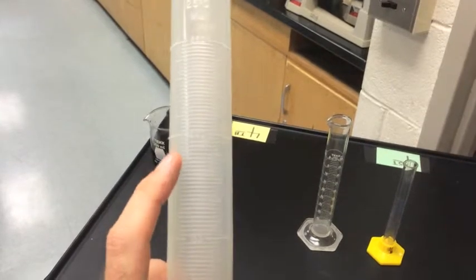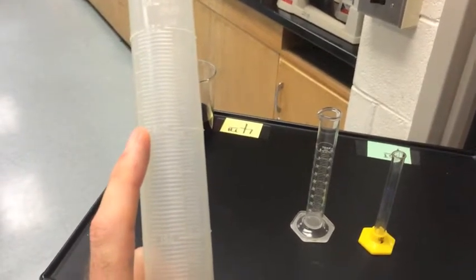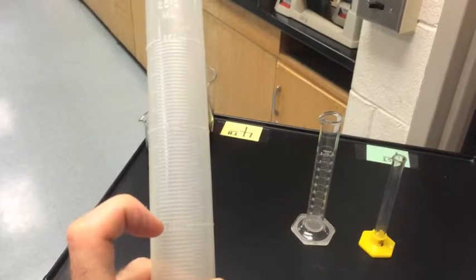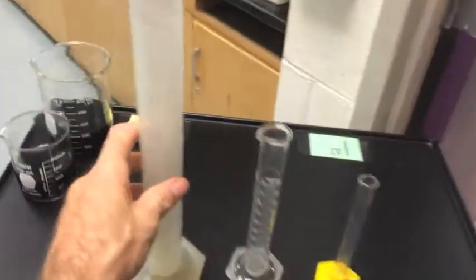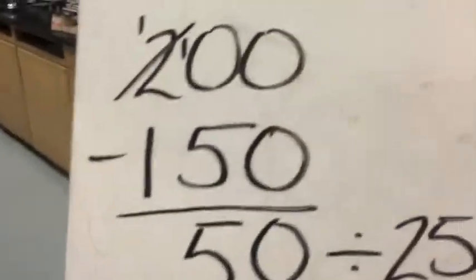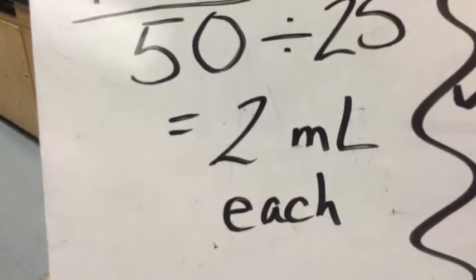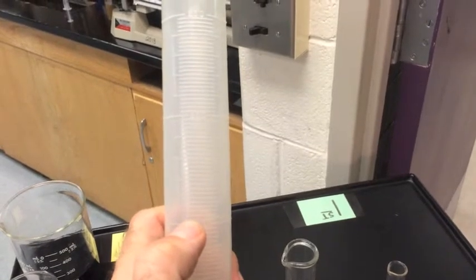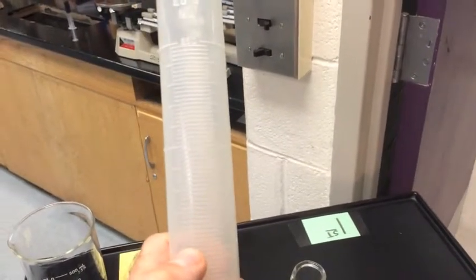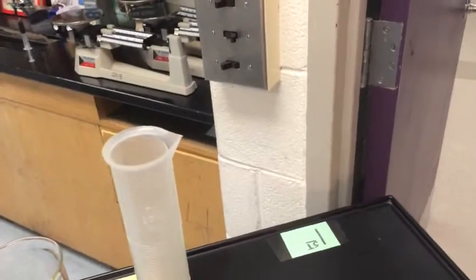Remember the formula that I'm teaching you about how to find out what each graduation, each line going up the side is worth. We take the top number, 200, subtract the next number down, 150, and then divide that number by how many graduations there are. It just so happens there are 25 of them, and so I did the math. 200 take away 150 is 50. Divide that by 25 graduations means each graduation is worth 2 milliliters each. So every time we count up, this would be 150 milliliters. This would be 152. This would be 154, 156, 158, 160, and so on. So you can tell what the graduations are.